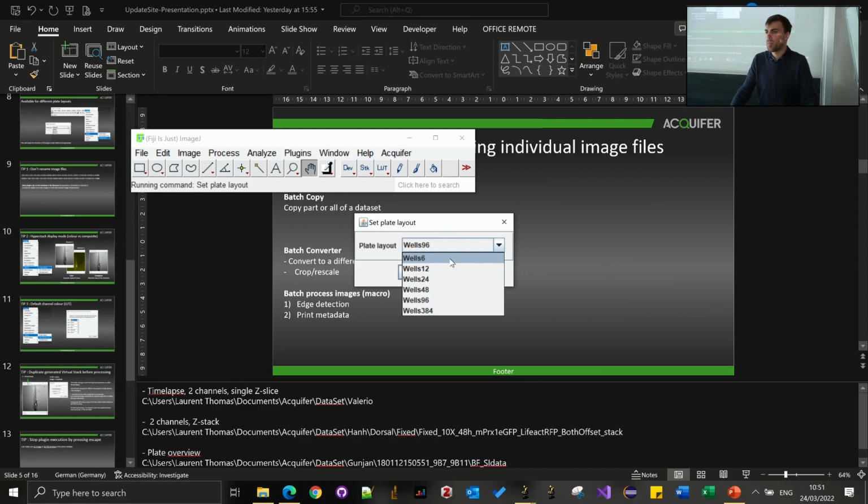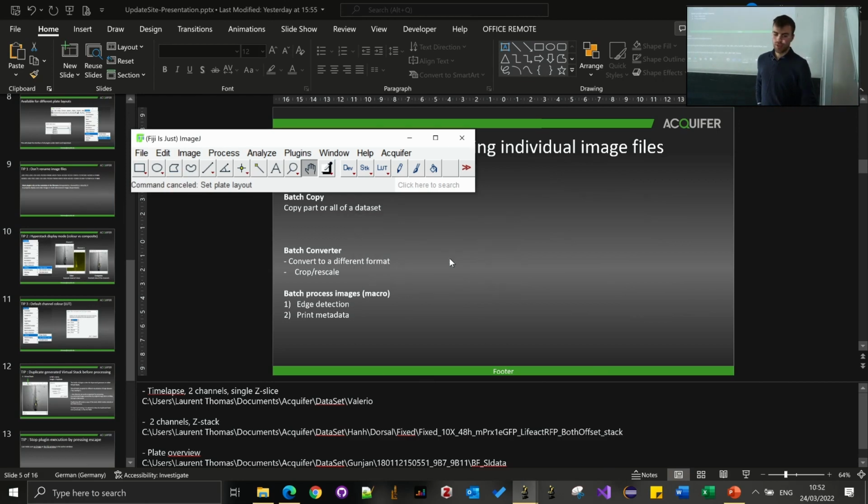I think for you it does make sense to try to implement everything, but it would be nice if the machine would save it as a log file, if it was a custom well layout. Like it saves the metadata and then you can just plug it in. Yes, probably. That's a good idea. But I need to see the data and the file names, how they're named.